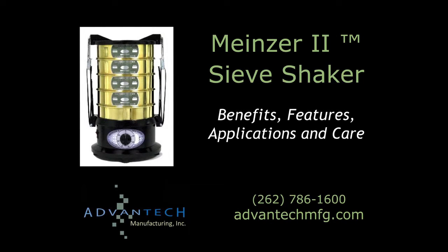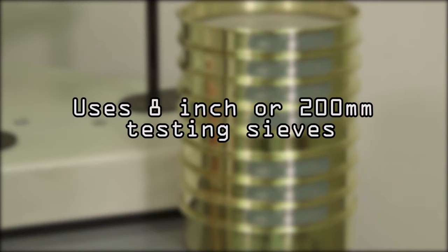The Meinzer II is Advantech manufacturing's maintenance-free, lightweight, portable vibratory sieve shaker suitable for the use of either 8-inch or 200-millimeter diameter testing sieves.